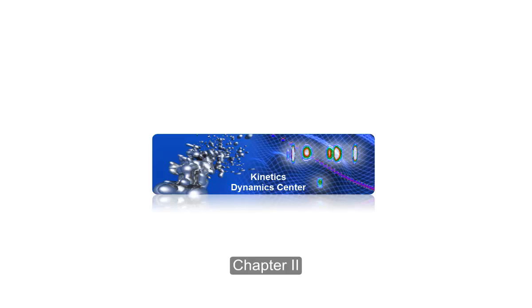This is the second chapter of Kinetics, your toolbox for NMR reaction monitoring data analysis. This chapter is dedicated to peak tracking and multi-spectra display. It includes waterfall plots and superimposed spectra view, with a wide variety of colour schemes to maximise impact.